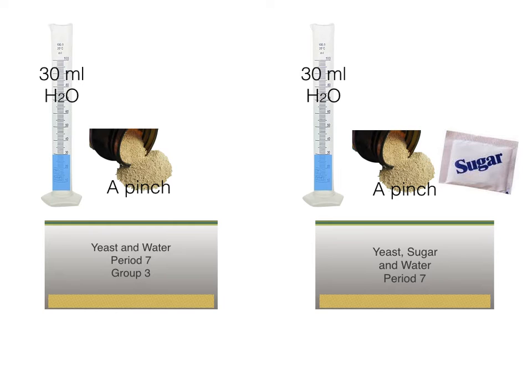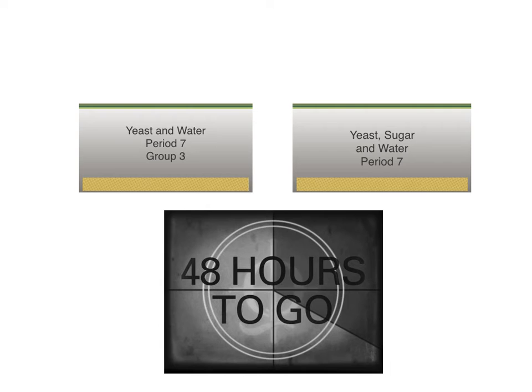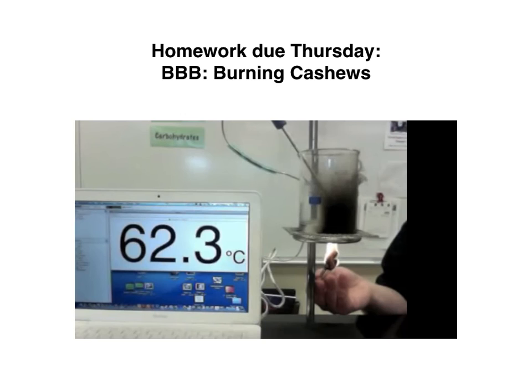Be sure to squeeze out any air that is inside the bag before you seal it, and make sure the bag is completely sealed. You are to place these bags in a designated place in the class. We will get the results on Thursday. We need to allow about 48 hours for the yeast cells to do their biological processes. When you are done setting up the lab and cleaning up, you can work on tonight's homework.